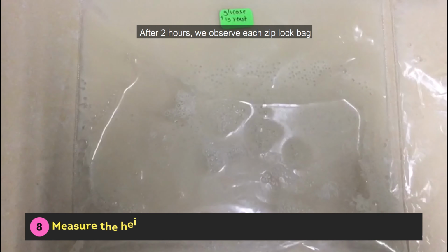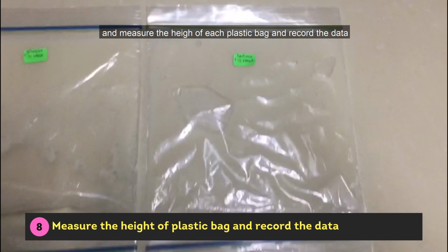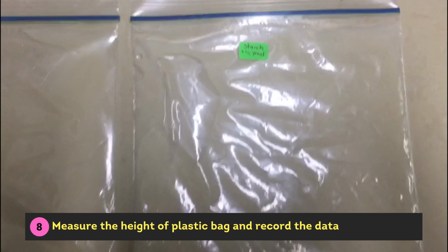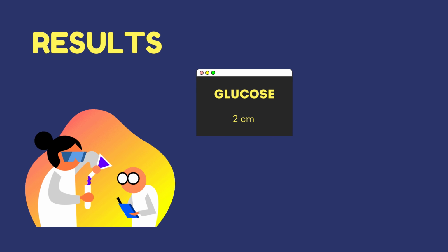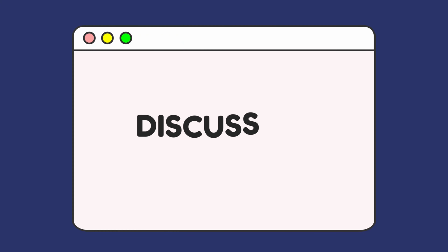After 2 hours, we observe each Ziploc bag, measure the height of each plastic bag and record the data. Results: 2 cm for glucose, 0 cm for starch, 0 cm for sucrose, and also 0 cm for the control.